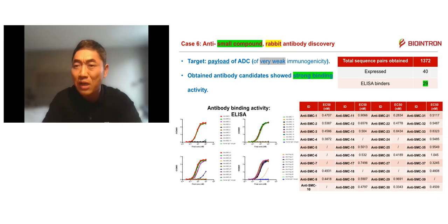And then we will discuss with our customer to see which paired sequences they may choose to be expressed. Based on their CDR sequences, also some PTM liability hotspots or anything else, they will choose, working along with us, tens of them or more, to be expressed for the downstream screening.